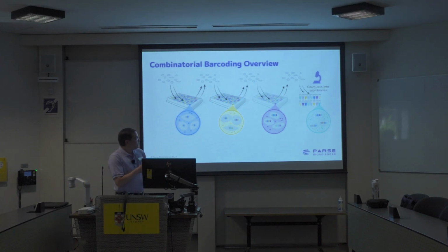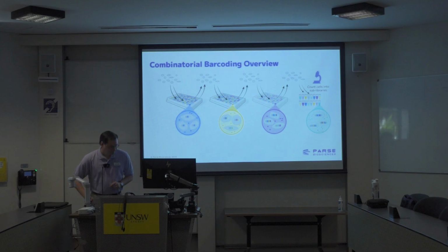What's also really nice is the number of cells you load into the sublibrary is how many cells you're going to get. So you can accurately determine how many reads you want to throw at each sublibrary, not just throw a handful into a machine and hope you get a certain amount back. You will know exactly how many cells you will get from your data from when you're loading your sublibraries.